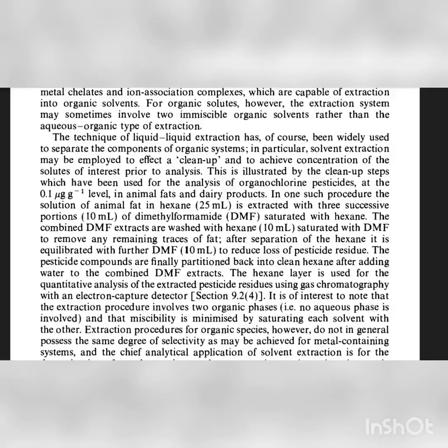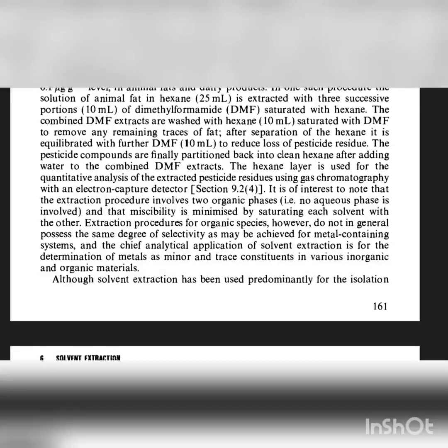It is of interest to note that the extraction procedure involves two organic phases and that miscibility is minimized by saturating each solvent with the other. Extraction procedures for organic species, however, do not in general possess the same degree of selectivity as may be achieved for metal-containing systems.